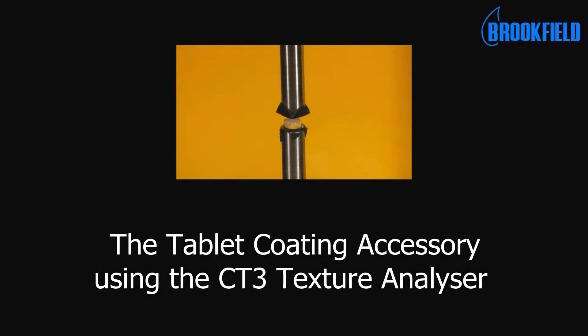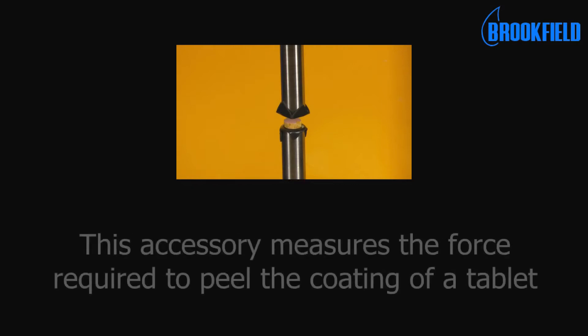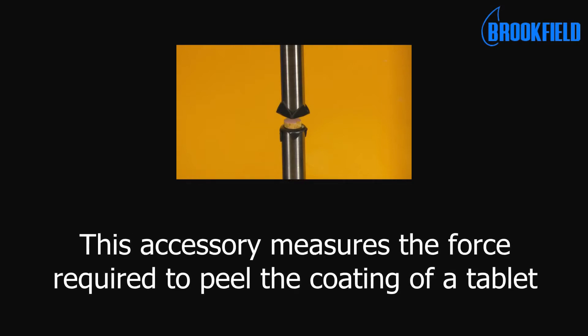This is the tablet coating accessory using the CT3 Texture Analyzer. This accessory measures the force required to peel the coating of a tablet.